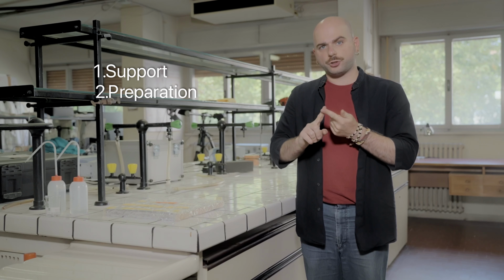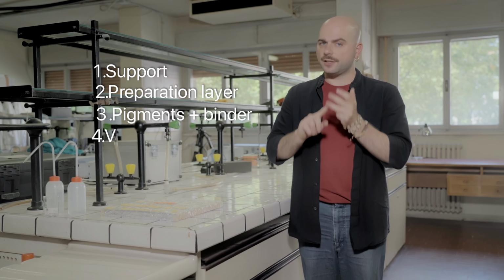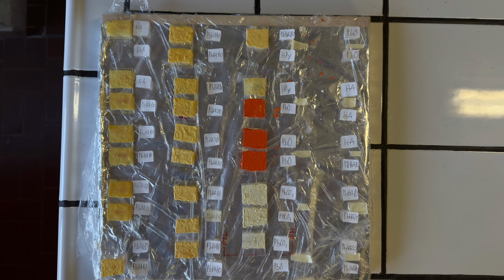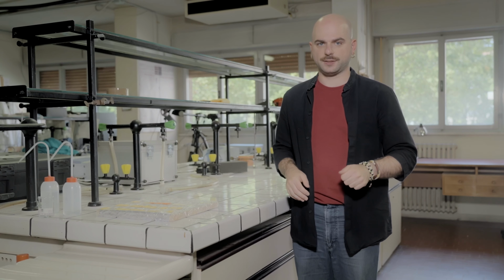As you can easily imagine, an artwork is a complex system. For example, in a painting, there generally is a support, a preparation layer, different pigments mixed with binder, and a varnish. For this reason, I decided to create paint models. This experiment will help to get a little bit closer to a real artwork, trying to imitate it. I prepared 4 different sets and let them naturally age in dark conditions for approximately 1.5 years.